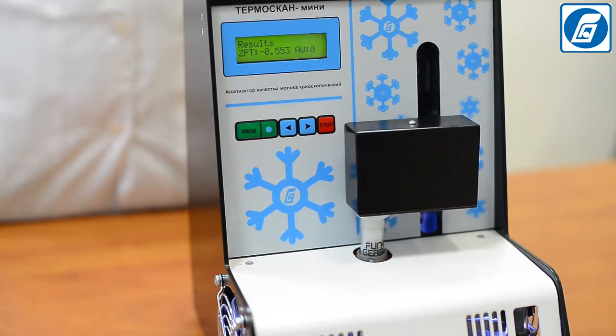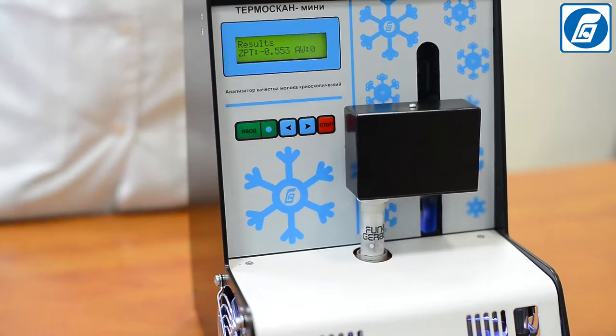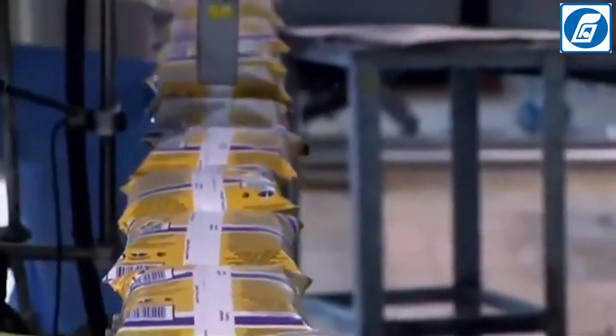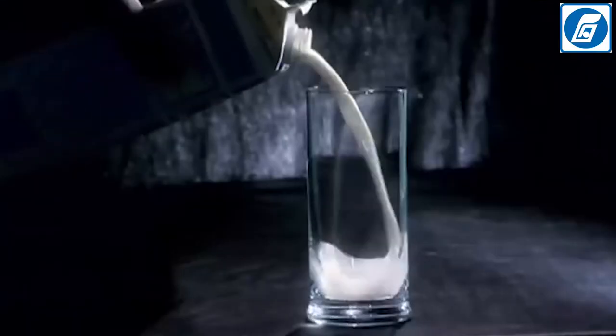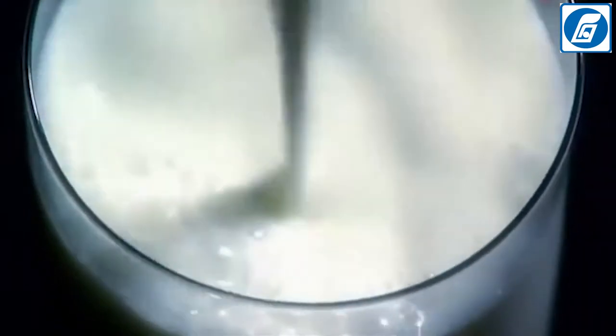For the analysis, samples of the following types of milk can be used: raw, pasteurized, UHT milk, sterilized, and partially or completely skimmed milk. Samples of normalized milk containing salts of citric acid or phosphoric acid cannot be used for the analysis.